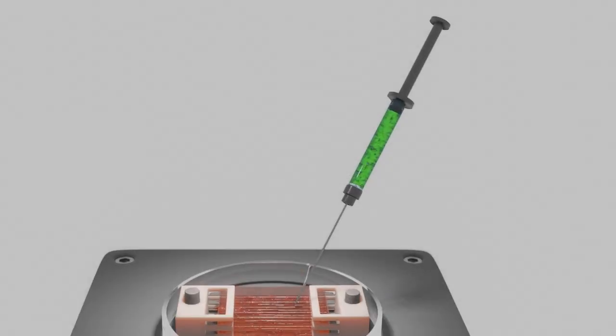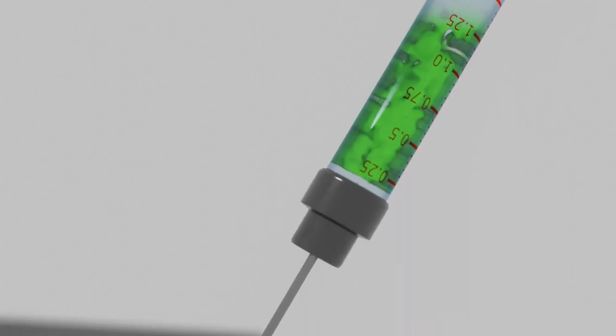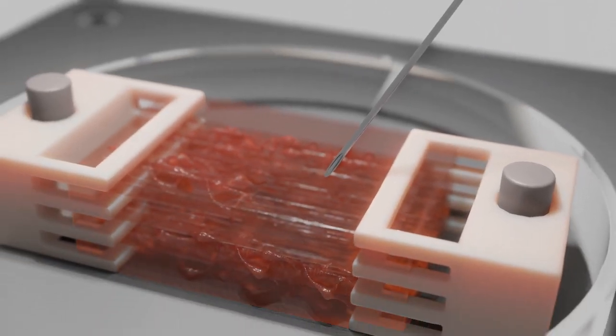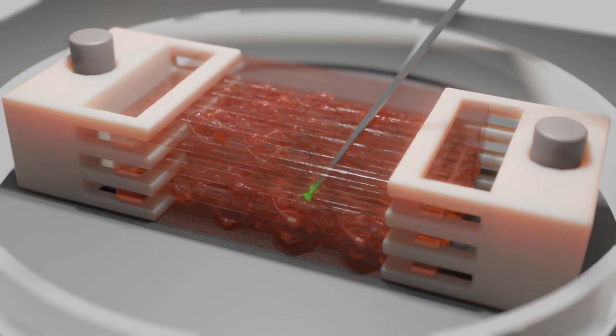Our constructs could serve as a biomimetic vascularized muscle model for pharmaceutical tests in which drug molecules with different sizes could be delivered by simple addition to the liquid media or via a local tissue injection that mimics intramuscular drug delivery.